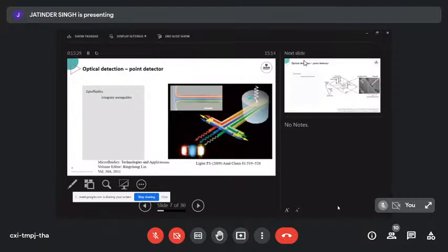What other things people have done with optical things, and this is in the hope there's a couple of people that like physics here. So instead of using a detector that comes from external optical components, you can actually use fluids in a microchannel as liquid light guides. There's different liquids that, depending on their refractive indices, can actually keep light contained as if they're in a channel.